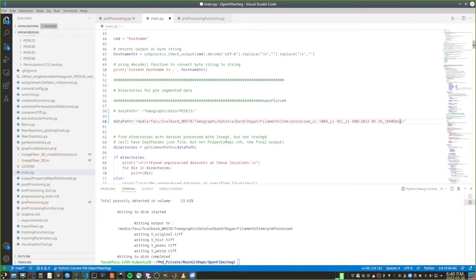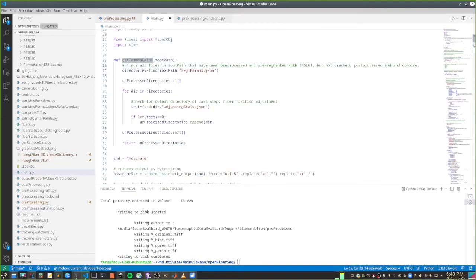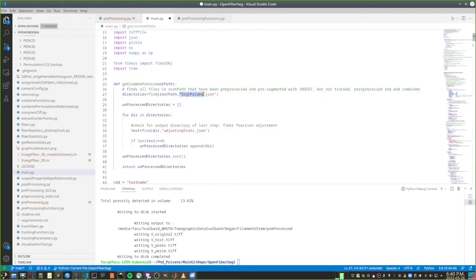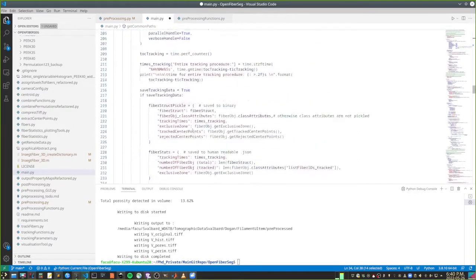And basically it's going to look for this function. It looks for any file that's named this way. And if it's not finished, like this is one of the last steps. Actually, I'm not even sure why that's there. It looks weird. But anyway, I'm going to show you how to launch it.